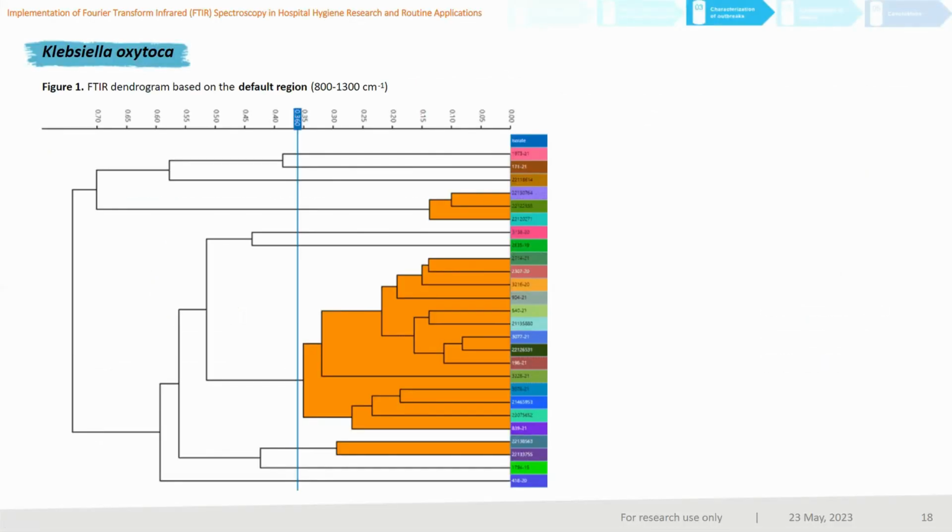This is the final dendrogram we obtained after the analysis of all the described isolates. Let's see the placement of each isolate I have previously described. We start with control strains, the susceptible, the OXA, and the old VIM isolate. That's good, they are far from each other. And next, since the outbreak was occurring in the children's ward, let's see now the adult isolates. It seems that there are no important relations between them. Moreover, the isolate of the child coming from another hospital was also very far.